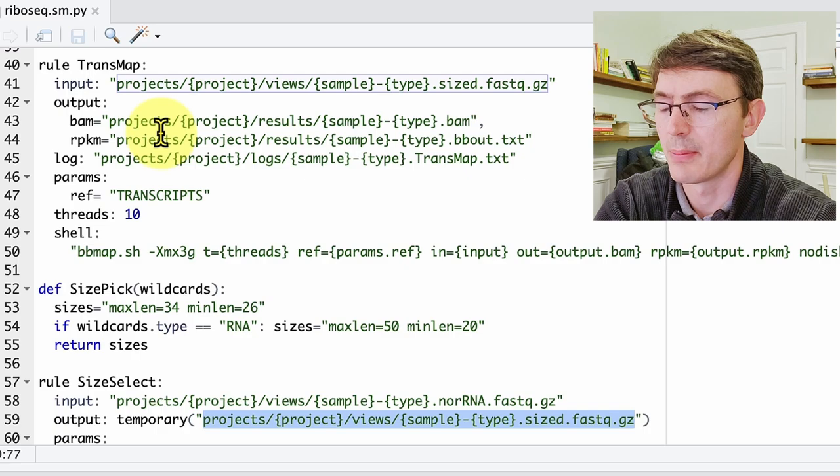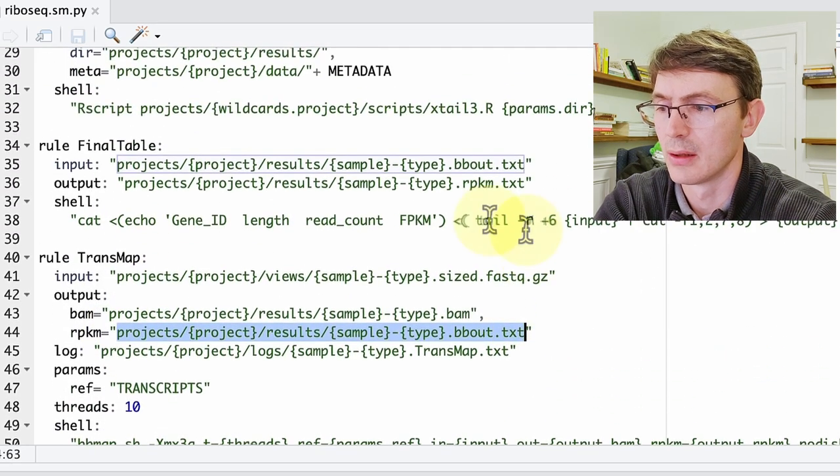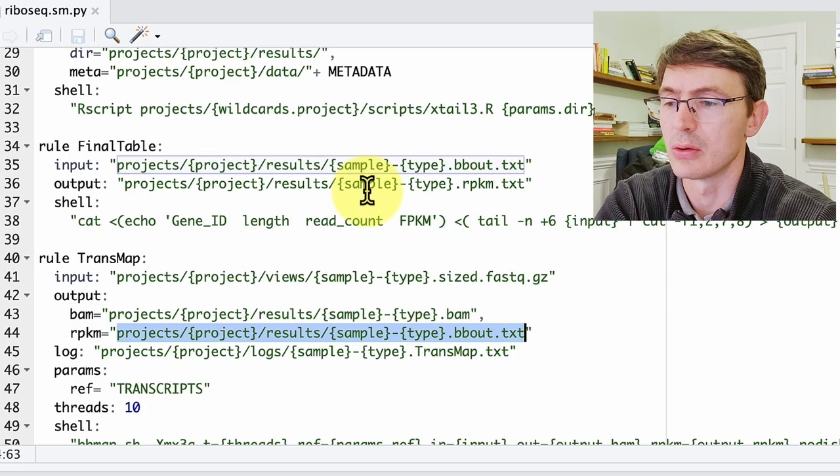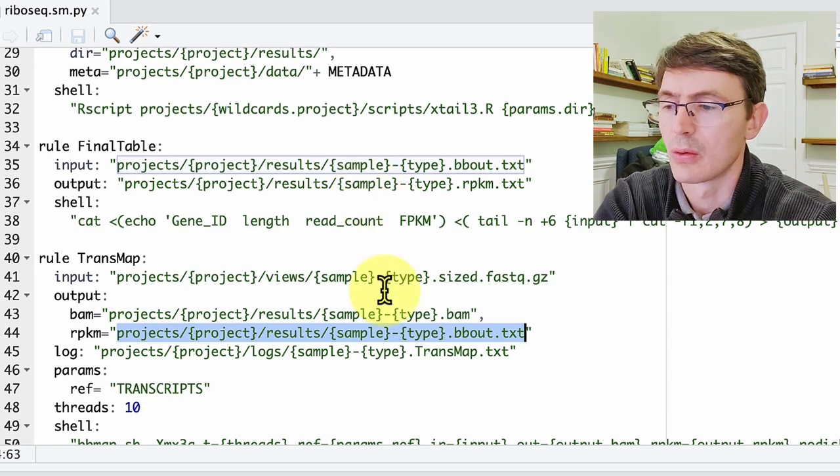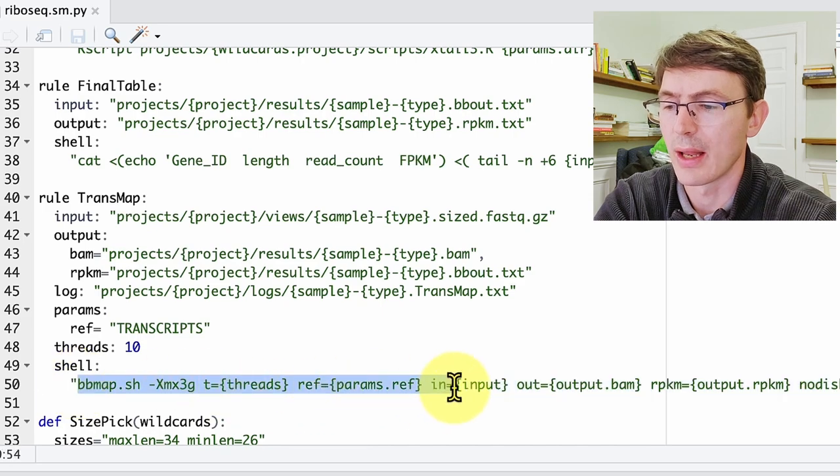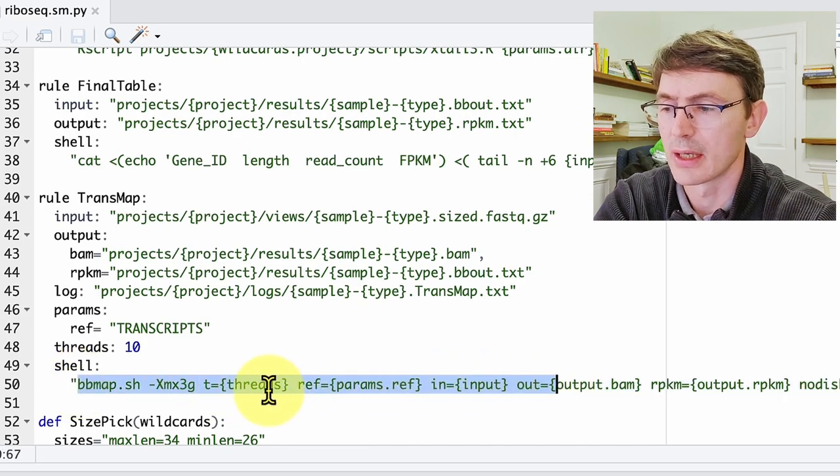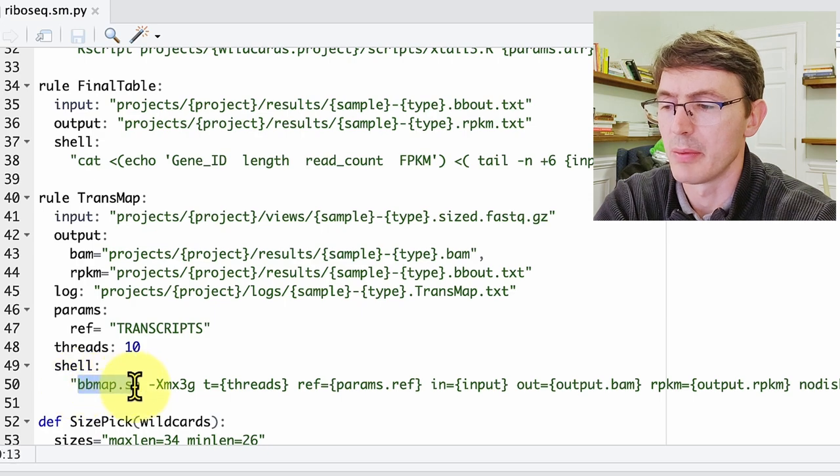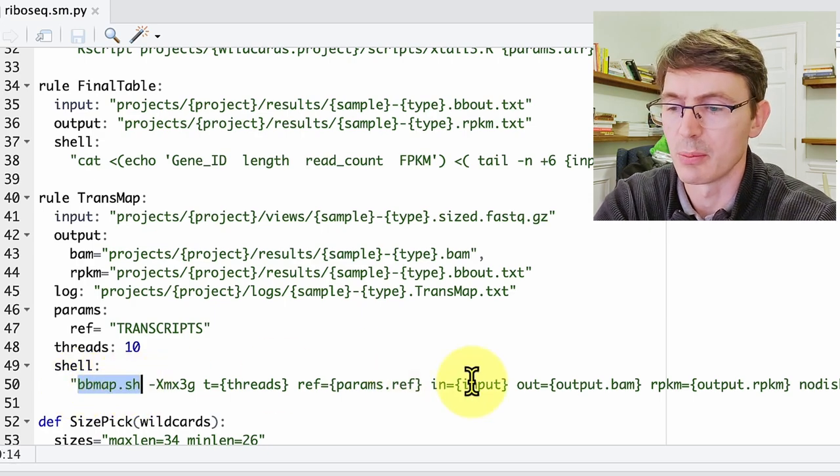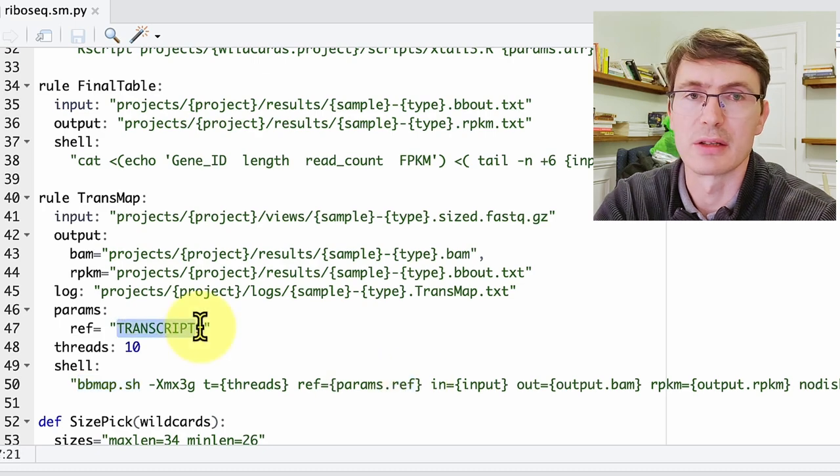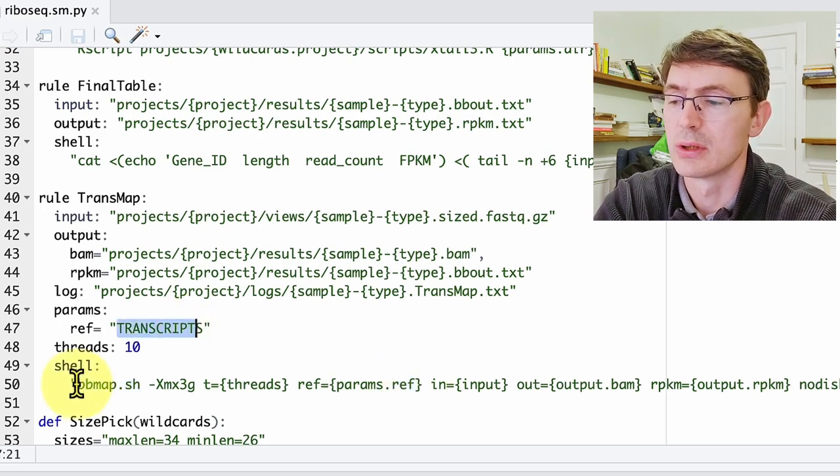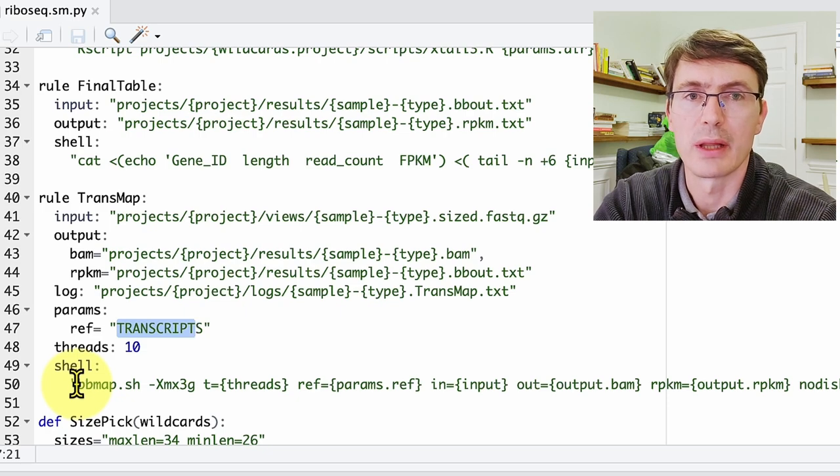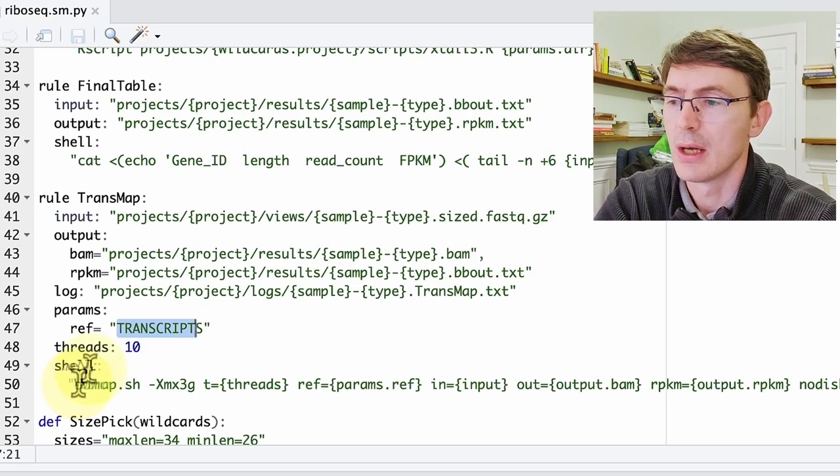Once we have those size-selected reads, we do the mapping with this trans rule map, and then we do some small formatting of the table before we feed it to ExtAil. So you see that here the rules feed into each other quite directly, and all of the commands are one-liners that you have here and they are quite explicit. So here we are doing the mapping, we do bbmap.sh, and then we feed the input, the output, and what's the reference, the transcriptome that we will feed to this one-liner. And all of those rules are pretty much the same, a one-liner that is quite self-explanatory.